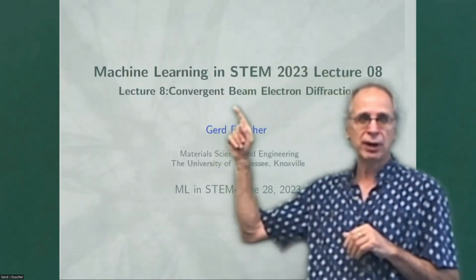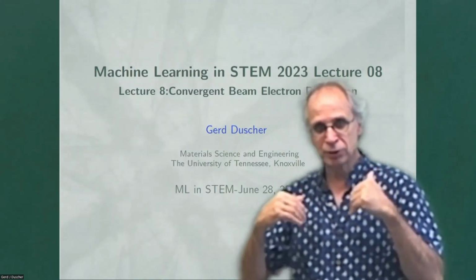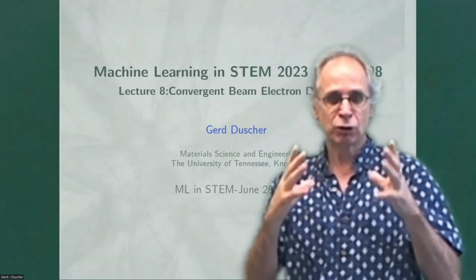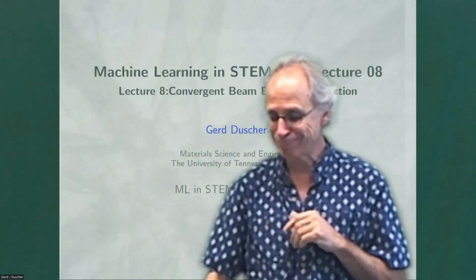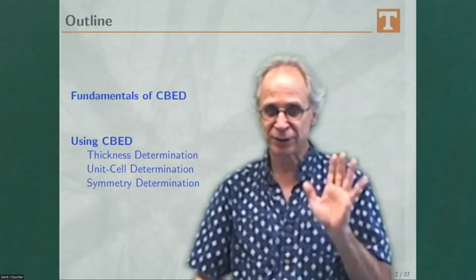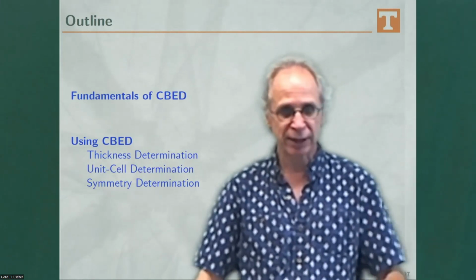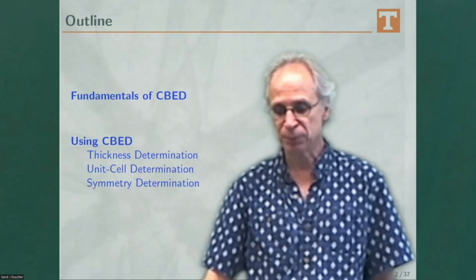So we have now gone over the background of the vocabularies that we need to understand what I want to say here. Okay, so that's why I thought I need that to remind you, or if you haven't done much diffraction, this excitation error is a new concept for you.